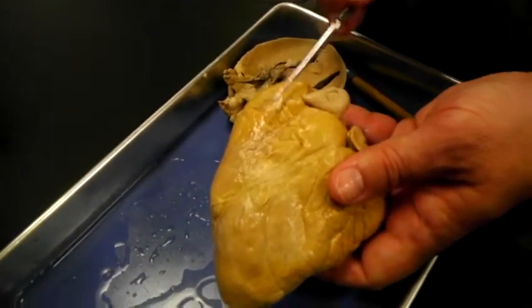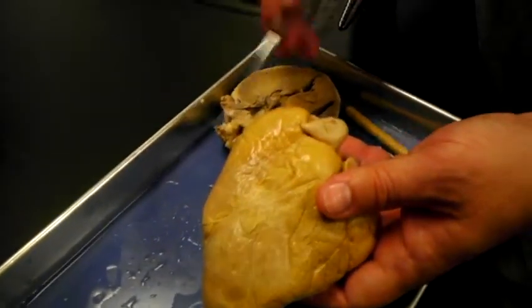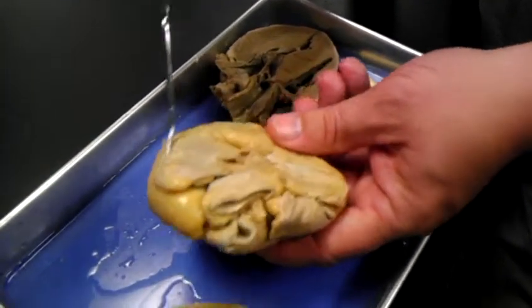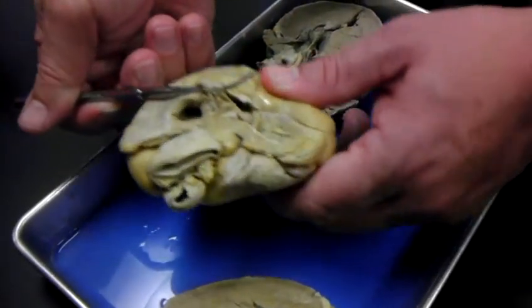So I know this is the right side. When I'm thinking of the vena cava, it's the right atrium that they enter into. So here's the right side, here's the right auricle. Well, the auricle is just an extension of the atrium. Look at that little hole right there. Atrium. Okay, and then look at this hole back here.